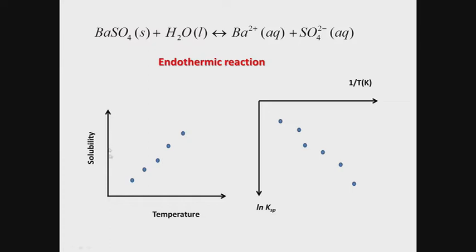In this particular experiment, you are going to obtain for every chemical equilibrium the conductance of the equilibrated mixture, and your observation would be as you are increasing the temperature at which the system is allowed to undergo equilibration, the conductance value would increase.